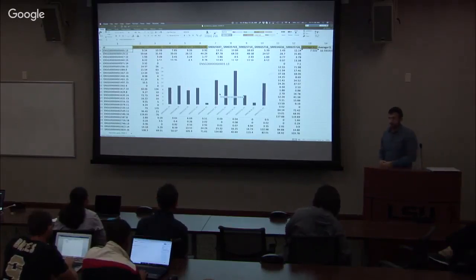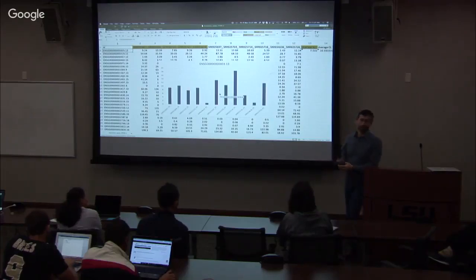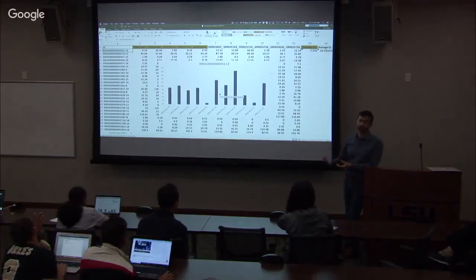So this was, we'll wrap up for today, and that was it for gene expression and differential gene expression. You will find in the online modules some more examples of things that you can do, including normalization and exploration of your data. And in the next workshop, we will work through the rest of the methods and go all the way to the end, to interpretation, to pathway annotation, to gene ontologies, etc. Any questions?